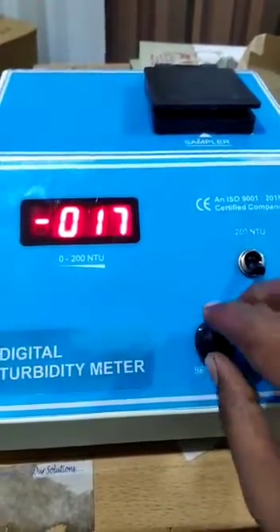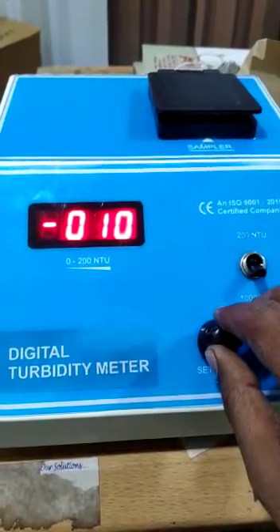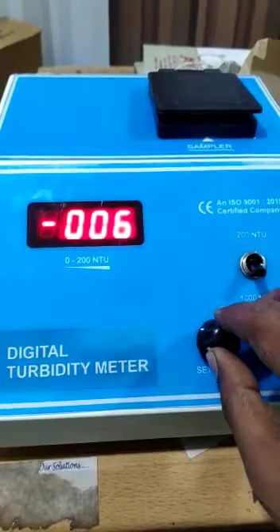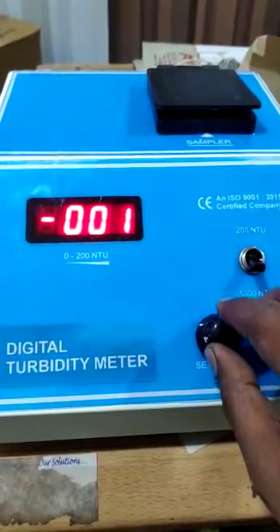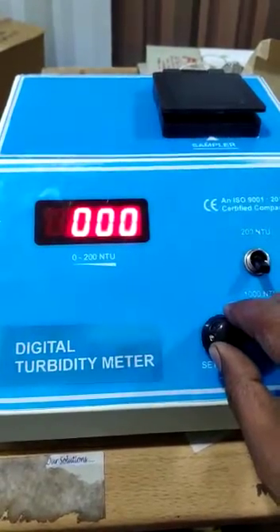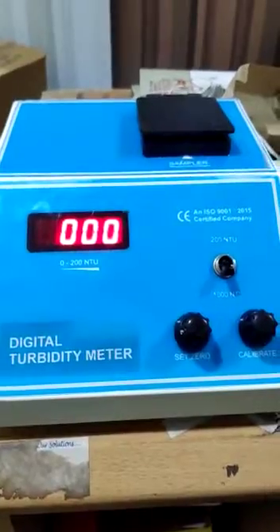Right. Do it slowly and be patient — slow down. Now it's zero zero zero and ready to use.